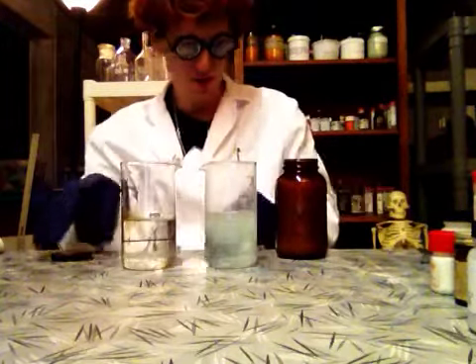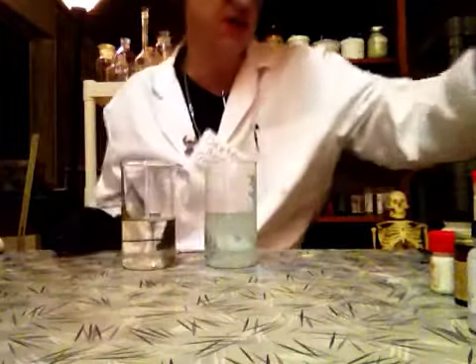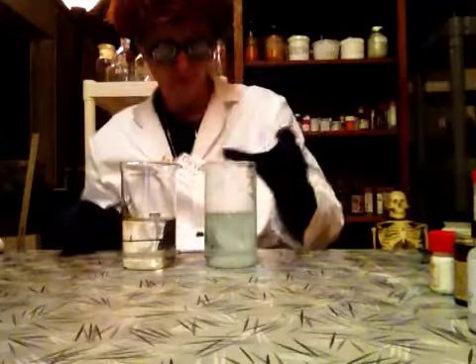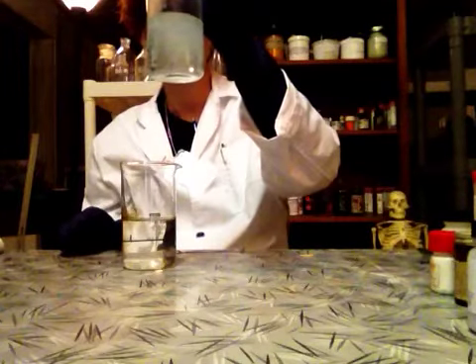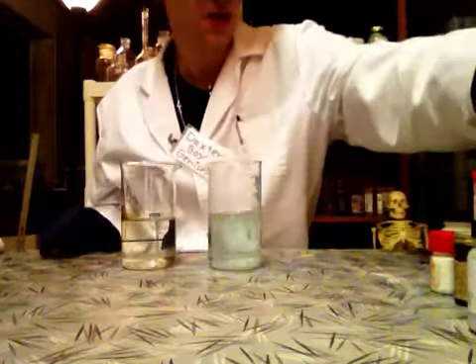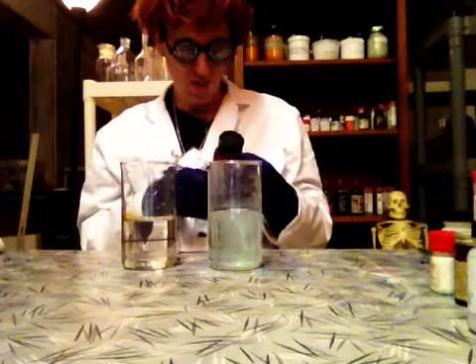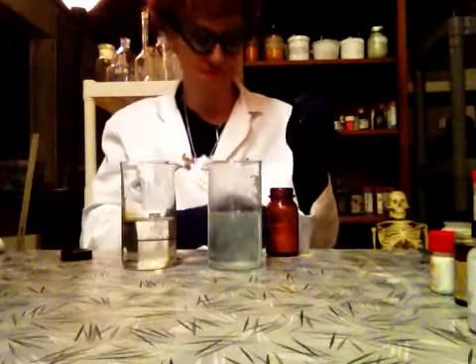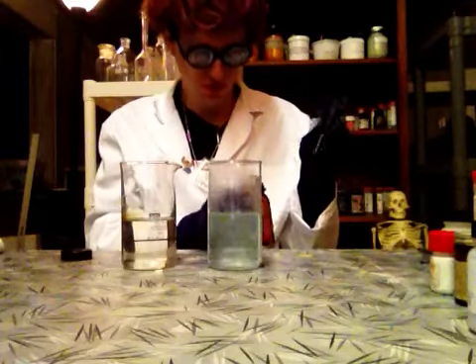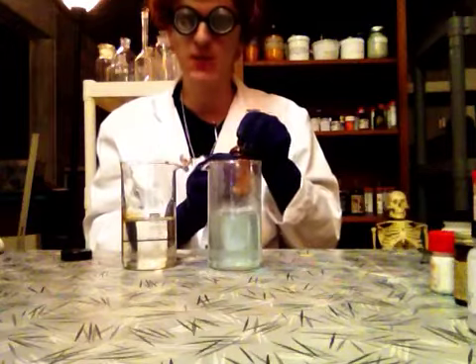It's fizzing. Yeah, it fizzed a little bit. Fizzed up. It's fuming. I'm going to mix — yeah, I can see the fumes. That one's fuming. Dangerous. But that's a boy genius.